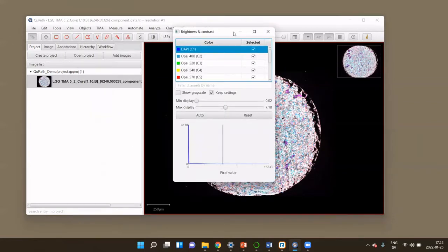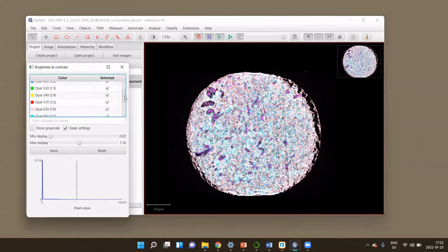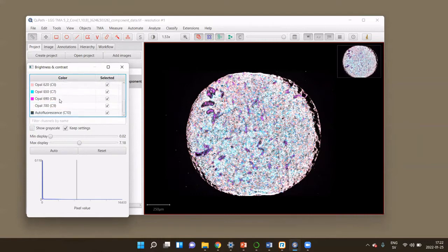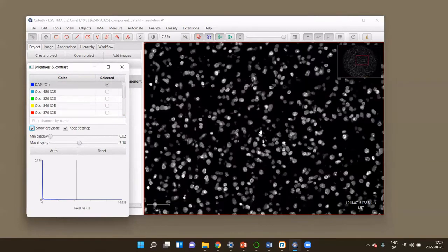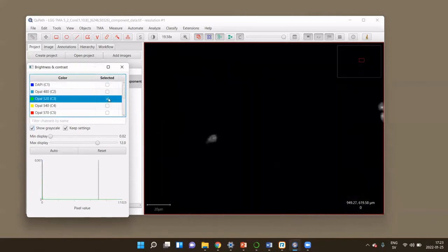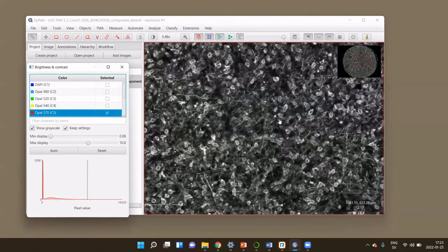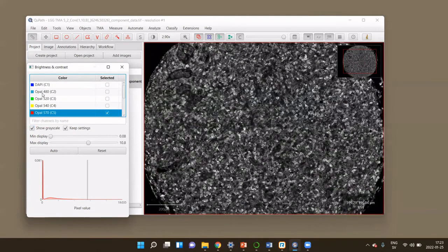I went to View > Brightness and Contrast. We can see here the different channels from the image data — in total 10 channels, of which nine carry specific information. I also like to switch to grayscale, because with that you can inspect the single channels more easily. You'll see the DAPI channel and then the different markers. Of course, you who've done the experiment know which marker is behind each specific dye.